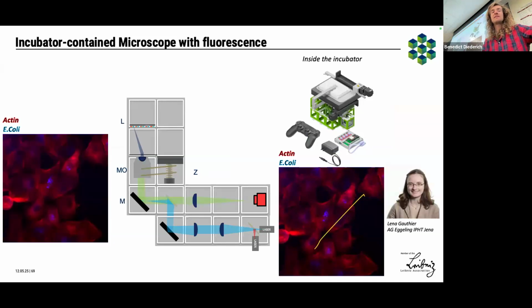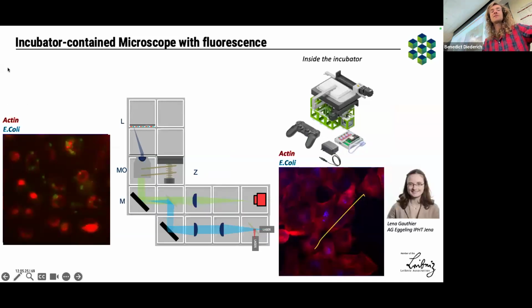How would I build it? Because you maybe saw that, from the previous slide to there, only a few cubes were added. So where's the mouse here? Now you have 2 lasers. They're focusing their beam into the so-called back focal plane. And then you have this here. It's basically almost the same. So folding mirror, camera, here's yet one more lens, but the principle is the same. So you can reuse all these components all the time. So that's why it's nice to have a library.